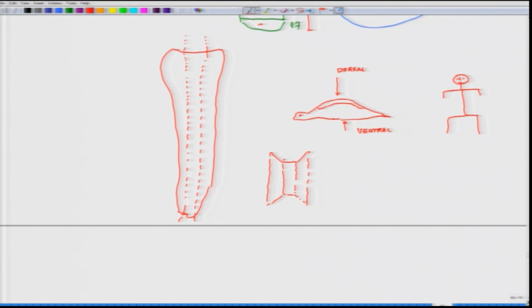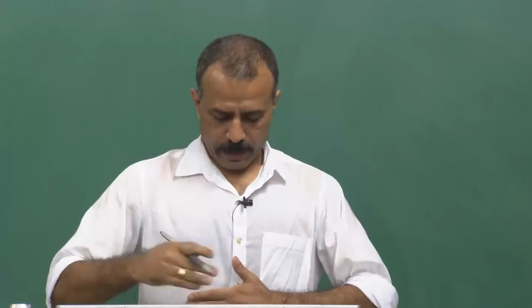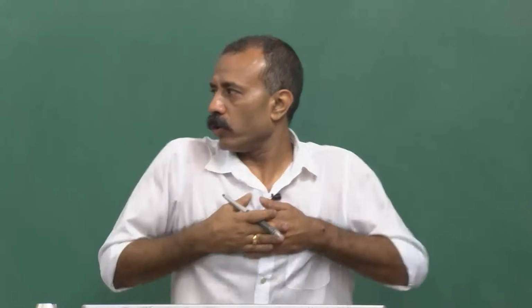So, this is a kind of central part, this is the side and this is the other side. Now, these two sides fold outward. In other words, if this is the ventral horn, you are looking at me from the ventral side, and if I keep it like this, it will be folding only like this. So, you see my arms on both sides, try to look at it like this.